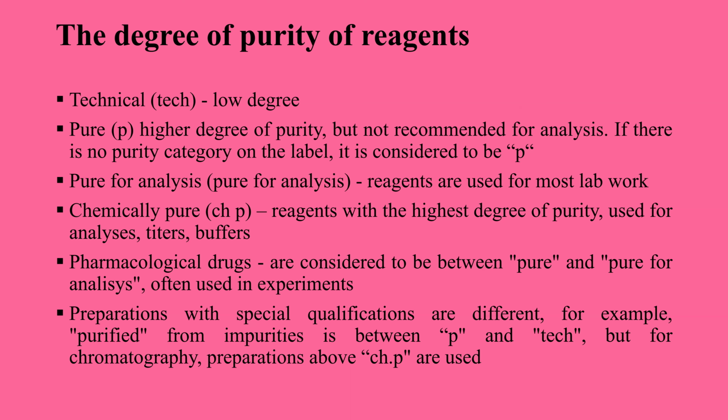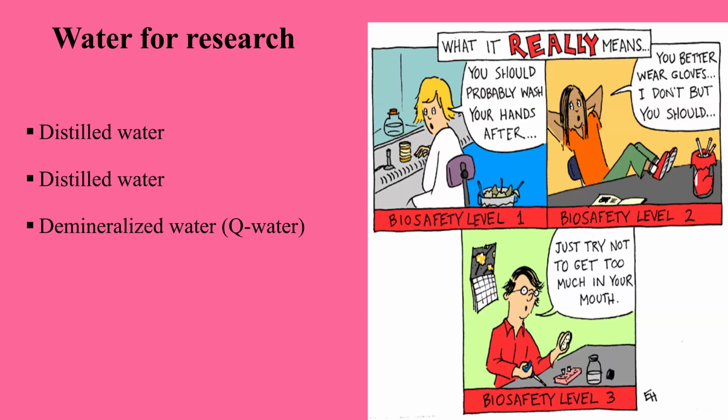The degree of this purity is between pure for analysis and pure. In some cases it's possible to use it in the laboratory for experiments. Okay, it's for very precise tests that use chemically pure reagents. Another important question is water.